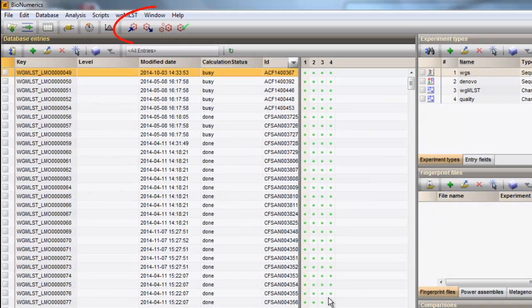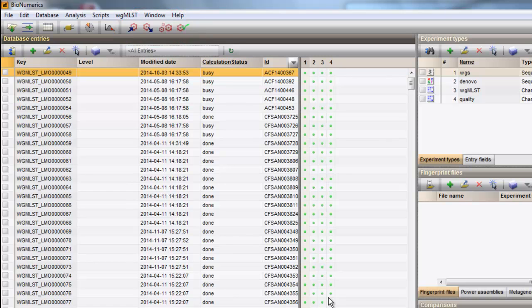Notice that these four buttons are added to the toolbar, and these four experiment types are listed in the Experiments panel.